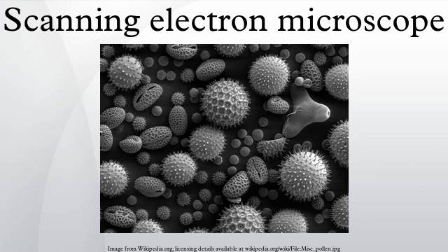Electronic amplifiers of various types are used to amplify the signals, which are displayed as variations in brightness on a computer monitor. Each pixel of computer video memory is synchronized with the position of the beam on the specimen in the microscope, and the resulting image is therefore a distribution map of the intensity of the signal being emitted from the scanned area of the specimen. In older microscopes, images may be captured by photography from a high-resolution cathode ray tube, but in modern machines images are saved to computer data storage.